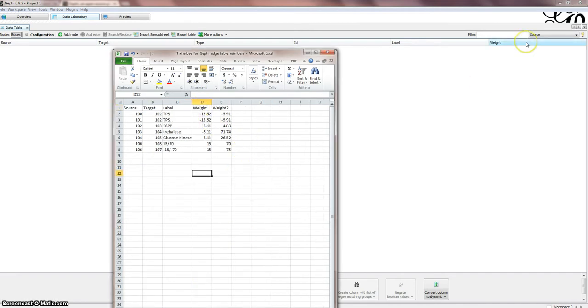This will automatically populate that column, and then the size of the arrows will automatically be set by this range of values here. So I've got a -13, so I did a -15. I found on this one, to get white as your zero color, you pretty much have to balance on either side. This becomes challenging because we only have negative values. So there are things like that.